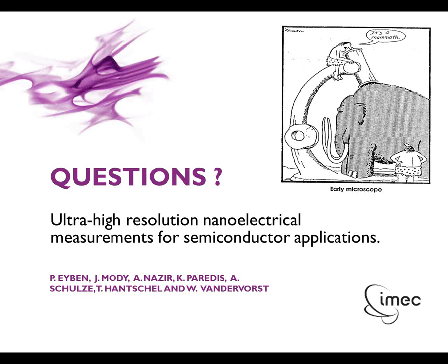Be it for high force measurements like SSRM or for the other modes where we typically use no peak force modes, so intermittent contact modes, we very rarely use tips with very low spring constants. So I guess that's a good point also about the peak force. You are using tips with a relatively high spring constant, so you do not suffer too much from this.